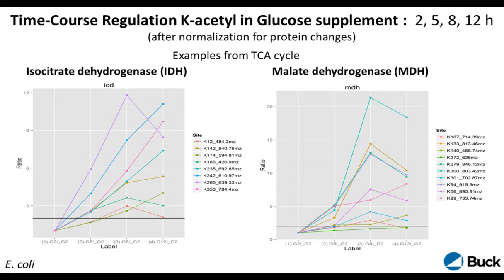One thing we find very interesting is that there's a very dynamic behavior of acetylation, or PTMs in general. On the left, if you take one protein, isocitrate dehydrogenase, and monitor different acetylation sites, indicated by different color curves, over a time course on the x-axis, you can see very different dynamic responses of PTMs even within one protein.